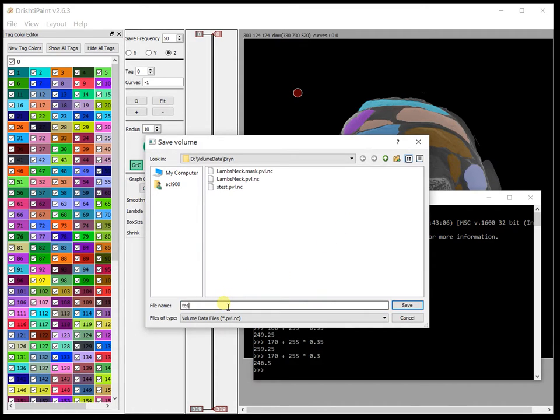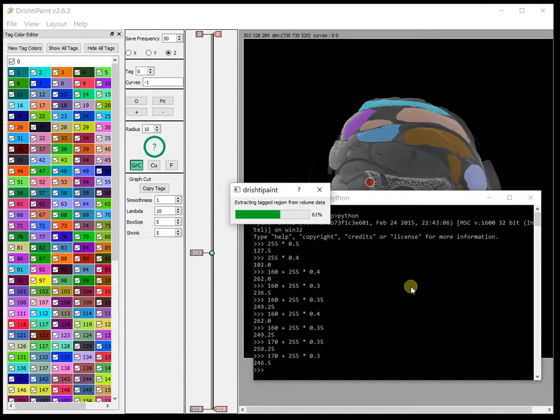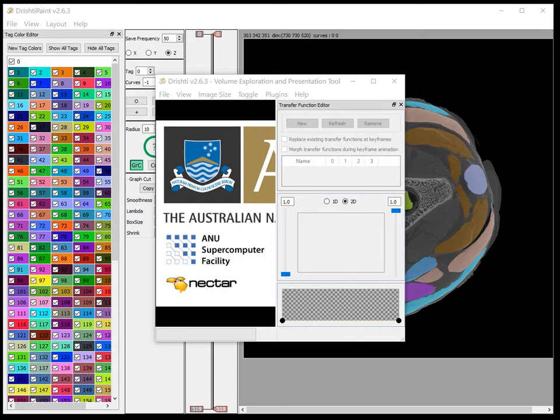So let's give it a test. Done. Let me start Drishti and show you the original volume.